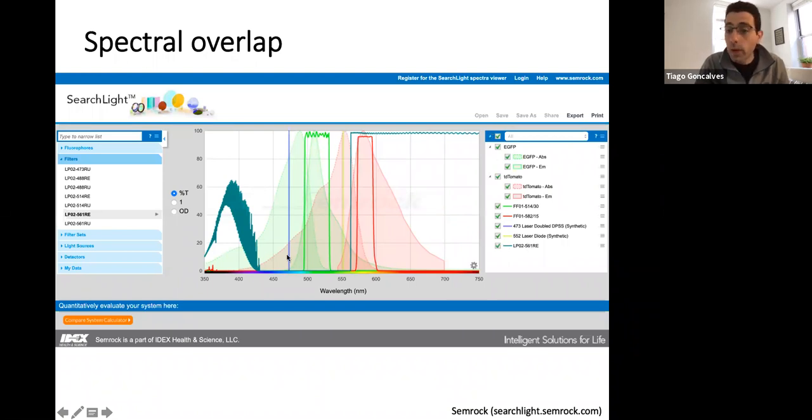And anything lower, so it's a low pass filter. And low pass is actually for frequency, not wavelength. And this here is absolutely or nearly zero transmission. One thing to keep in mind is that if you're really, really far from the area where the filter was designed, say here in the 400s, you have these weird effects where you can have some sort of transmission. So it doesn't block everything throughout the whole spectrum.